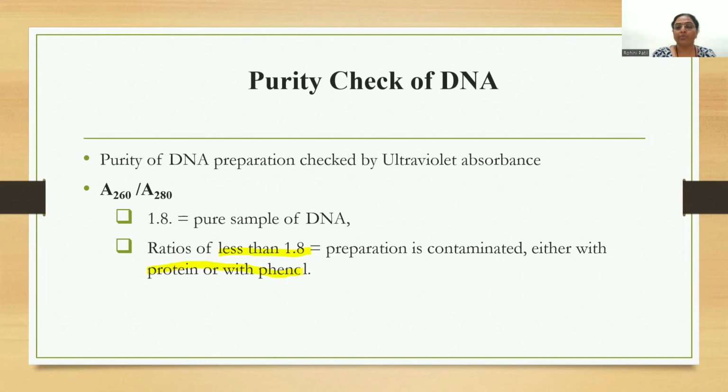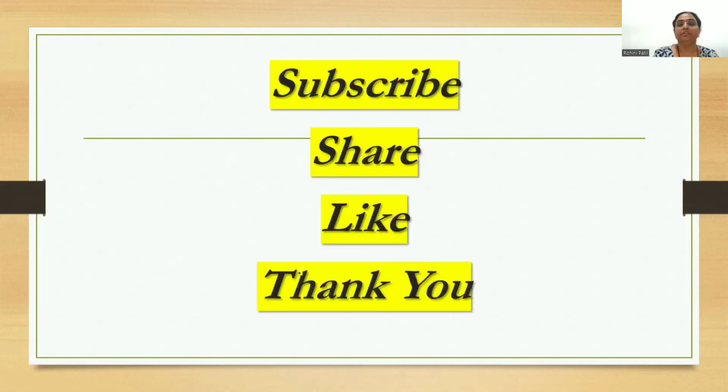I think you may have cleared the idea about the measurement and the quality check of the isolated DNA.